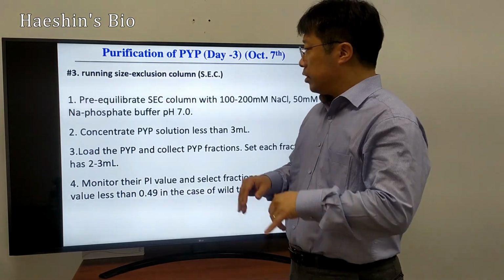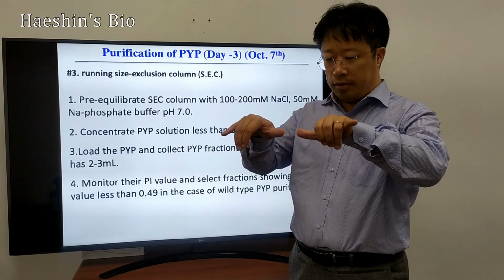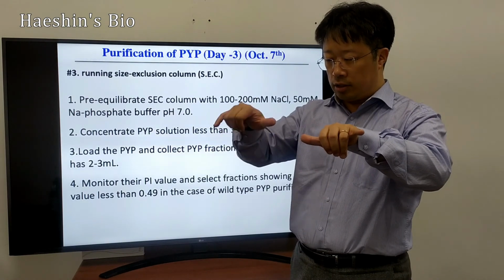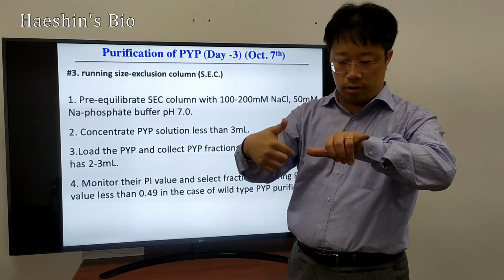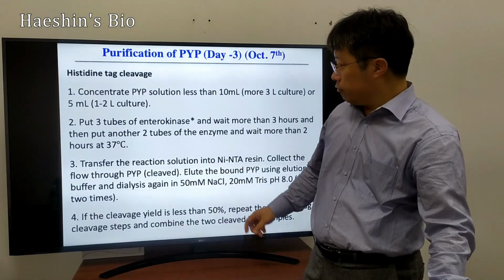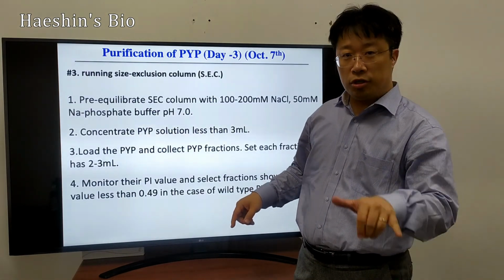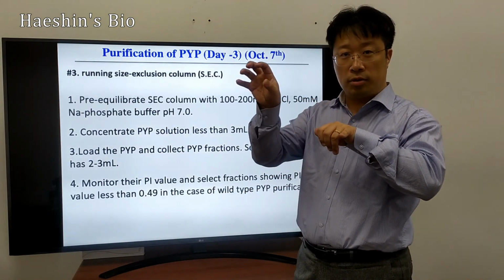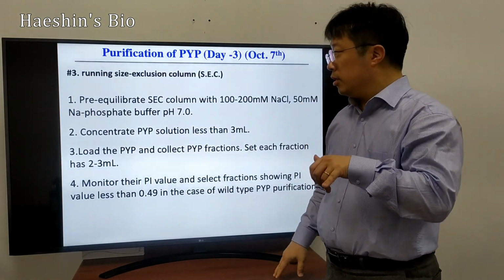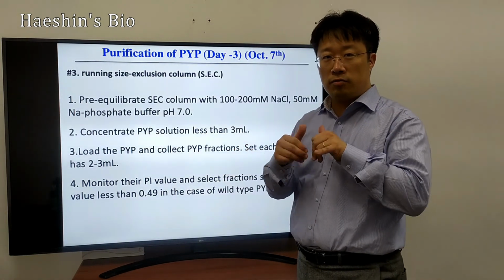So now, the solution is cleaved. The cleaved histidine tag will bind to the resin, and your protein is here. But it's not finished yet, because don't forget, you put in enterokinase. This is also an enzyme, so it's still a mixture of your target protein and enterokinase. So you have to get the enterokinase out. This enterokinase is a bigger protein compared to the size of the PYP.